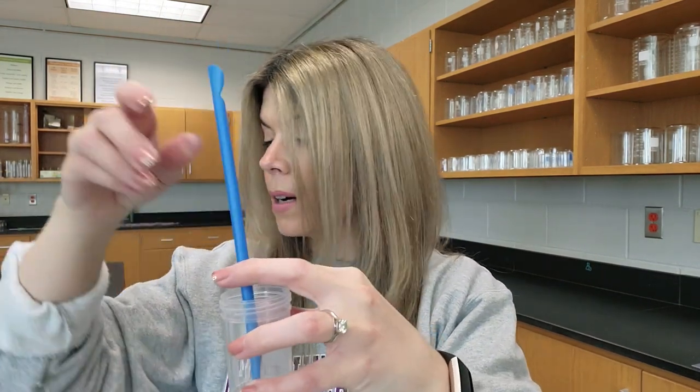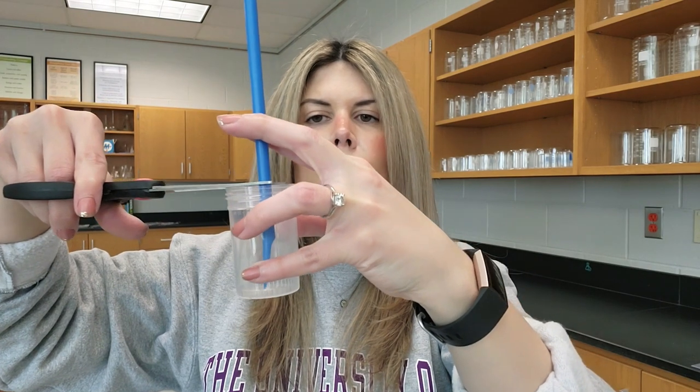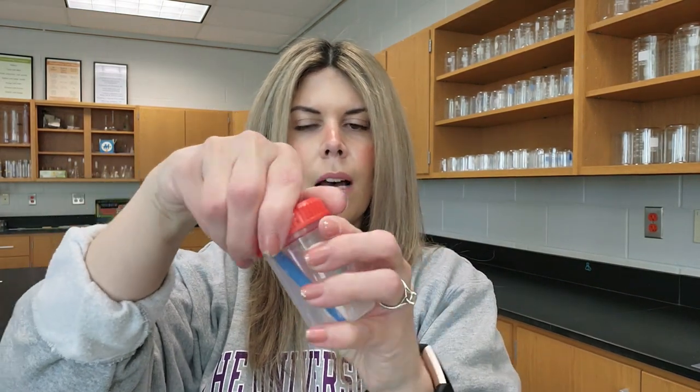I recommend you stock your lab with these disposable spatulas — they have a micro spatula on one end and a larger scoopula on the other. I put one right inside each specimen cup so students have their own scoop ready. What I love about them is that they're plastic, so you can actually cut them to fit inside the cup. You place the scoop into the cup, take your scissors, and do a little chop so it fits perfectly inside with the top on. It just makes things super easy — you don't have to get a special scoopula for every chemical. Everything comes pre-ready and set to go.